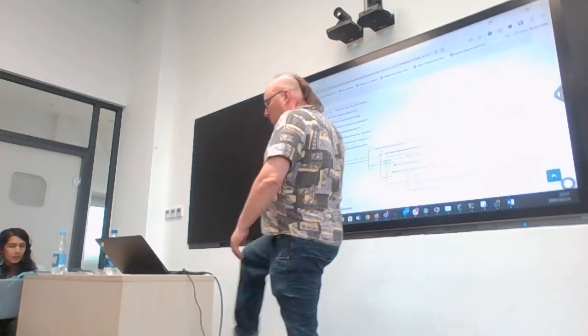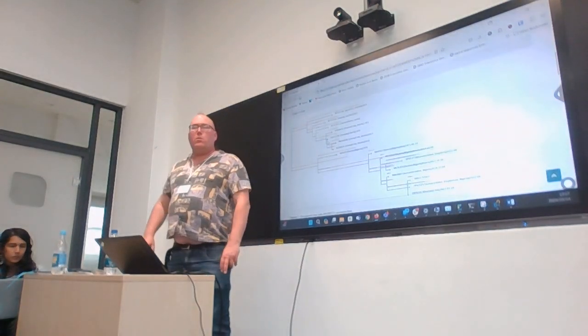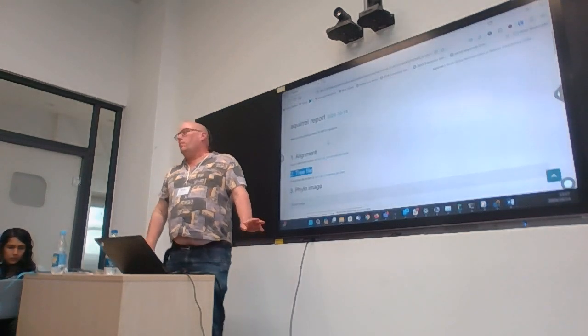So I just wanted to illustrate that we will look at this in more detail when you're running it. But this is the squirrel report, which, as I said, is useful for quality control and so on.